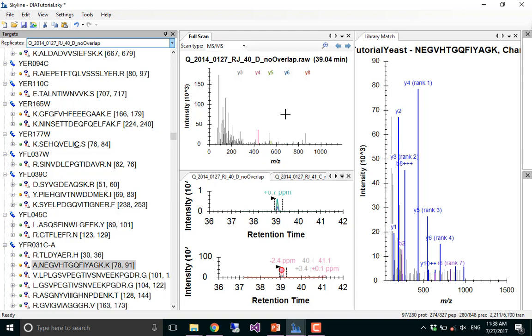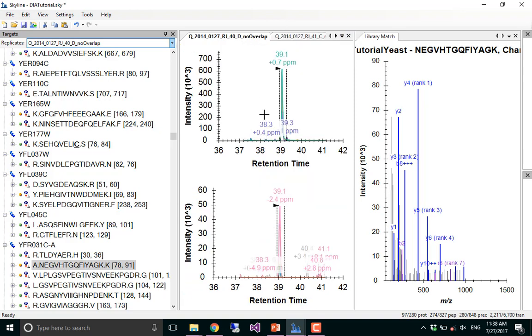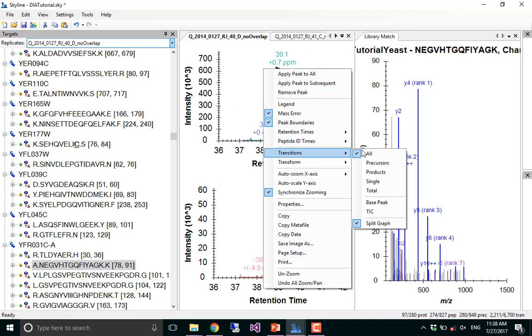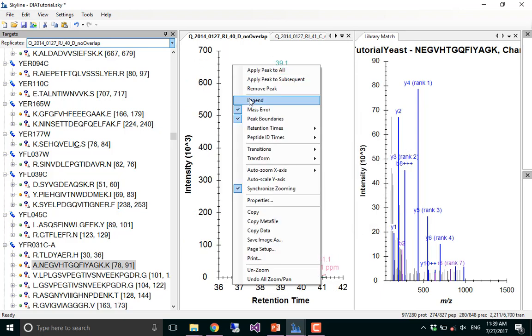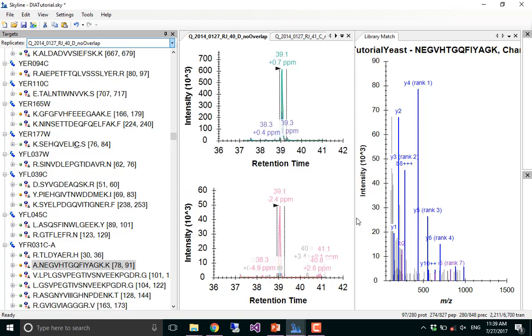So if I'm seeing only the MS1 in the main window and just click graph to make it work, it's not working. To show it in this one. So the MS1 is the same window. You mean with it not split like this? But when you hit split, it doesn't actually split to anything?